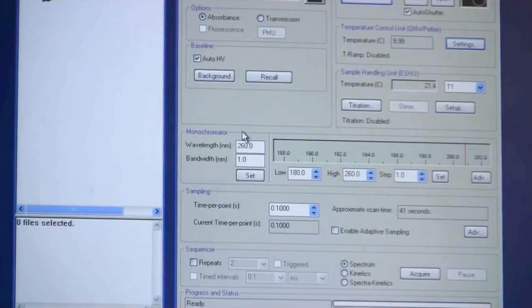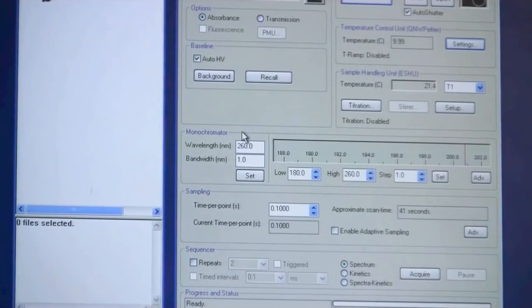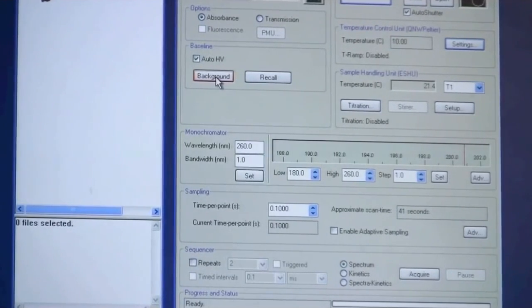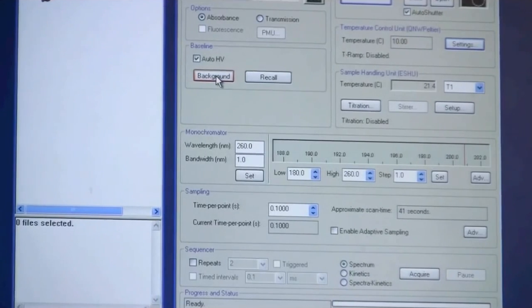Before I put in my samples I will make sure that I collect a background. So I will just click here.